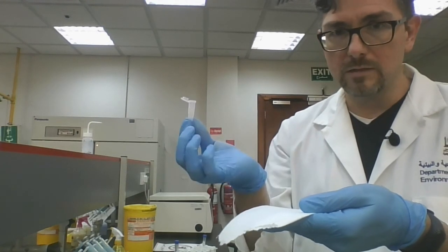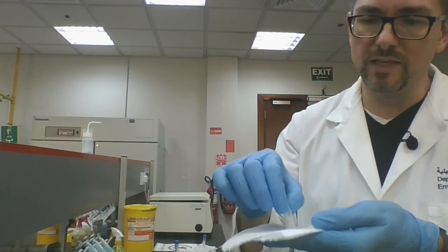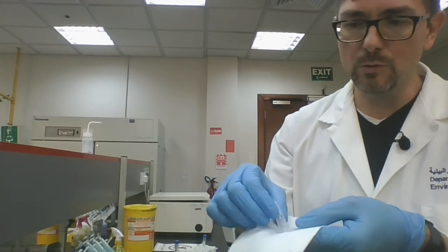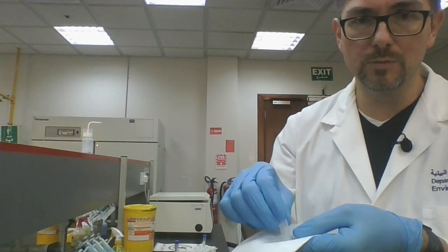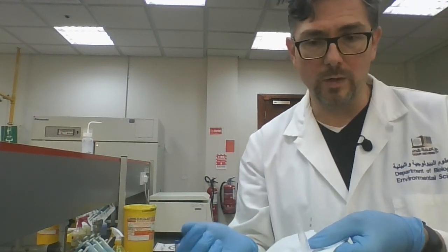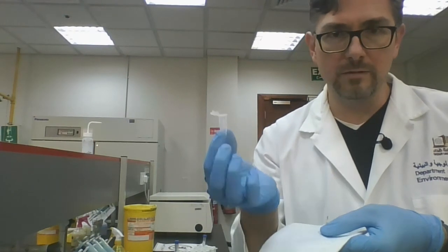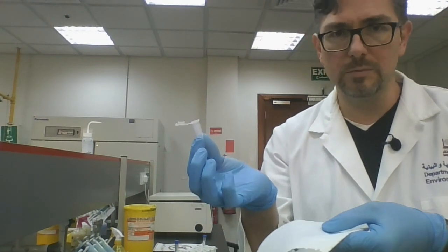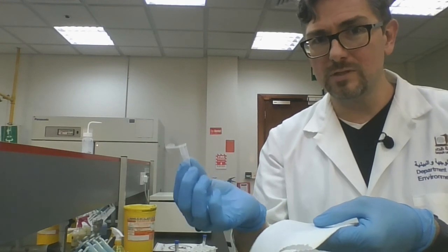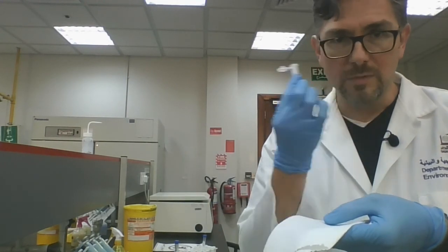After about 10 minutes, what you do is you sniff the tube. If you don't smell any ethanol, then it's probably dry. Again, look for any droplets of ethanol along the sides, which is why we're doing this initial step where we're just tapping out the liquid, so we remove as much of the actual liquid from here as possible. And also remember that 70% ethanol means 30% water. So if you don't smell any ethanol, but there are still some droplets in here, it's probably water at that point, so it's probably not going to be a problem. Ethanol evaporates fairly easily. It's very volatile. So after about 10 minutes, most of it should be gone from here. Again, after 10 minutes, smell it.